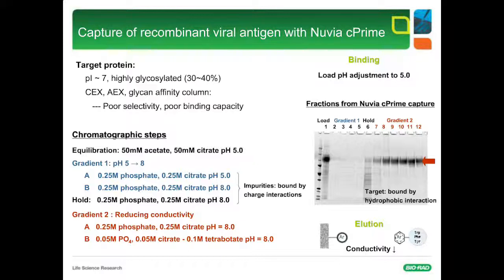We've demonstrated an example where they have an IgM, where you have a pentamer, all the way down to some very small HCPs. We haven't shown lysozyme. So yes, we do. I would not really segregate in my mind small biomolecules versus large ones. We think of these more as therapeutic types of molecules. Antibodies being large, but then we have also viral antigens and enzymes and fragments and all of these things. As long as they have some functionality on them for interaction, we can basically manipulate that in a purification. Hopefully, we can do it well.